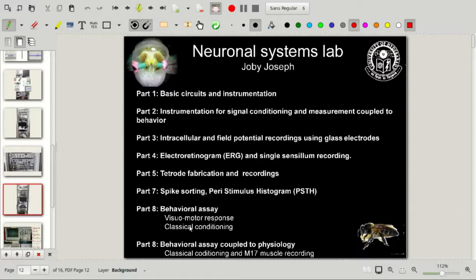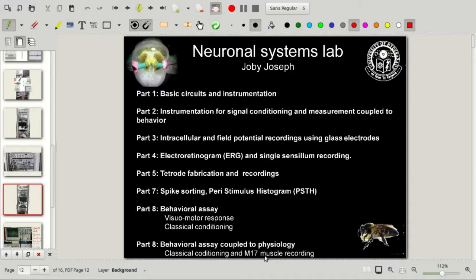Of course, we need behavioral assays to assay various different things. Two commonly used techniques in our lab are the visual motor response assay and the classical conditioning assay. For both of these, we use honeybees as a model system. Sometimes we have to couple behavior with physiology, and there are issues of synchronizing the signals. To illustrate this, we will do a simple assay combining classical conditioning with M17 muscle recording — a muscle which controls the proboscis extension in bees. PER conditioning is the classical conditioning, and recording from muscle M17 is the motor readout from this system.